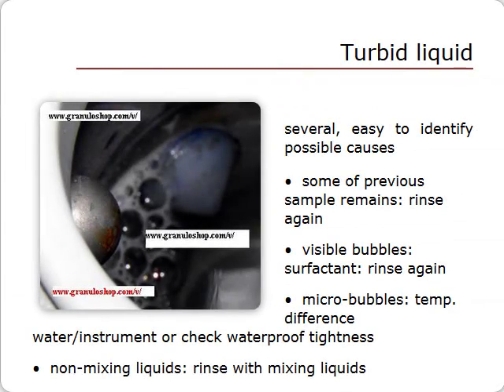If the liquid is not clear, the set zero will obviously be too high. Possible causes are easy to observe. There may be some of your previous measurement sample left in the unit — rinse several times, then try a new set zero. If you are seeing bubbles, they are often caused by some surfactant left behind by a previous measurement or rinse — rinse again. Liquid may also contain hard-to-see micro-bubbles, sometimes due to a temperature difference between the liquid, such as tap water, and the instrument, or due to a micro-leak in the circuit.